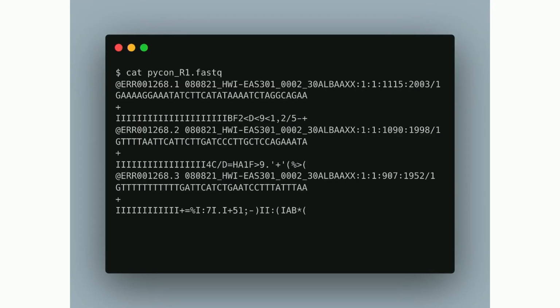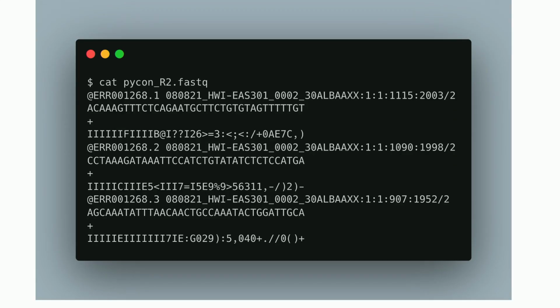I'll look at this file now. And so this has a header line as well, you can see there. And it's got some As, Cs, Ts, and Gs. But the other thing it's got there is all these ASCII characters down the bottom. This is what's called the R1 read. There's also a pair, R2. And these are two bits of information that have come from the same molecule, just sequenced from either end. And so if we can't capture the whole molecule, we can get either end and sort of work out where they are in the genome.